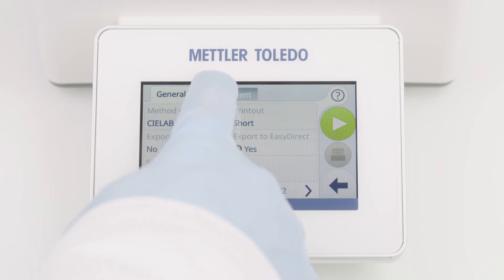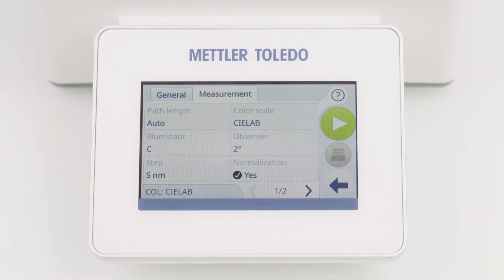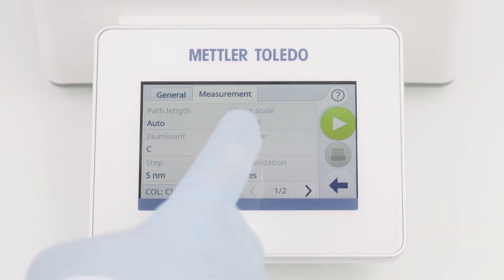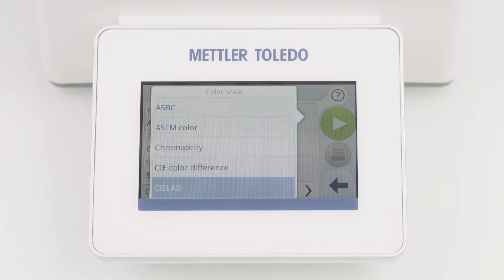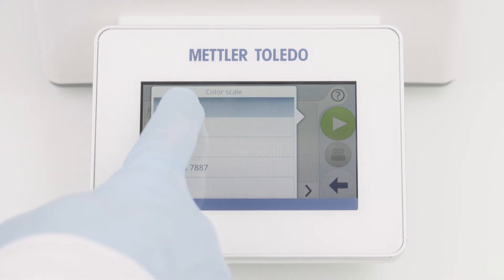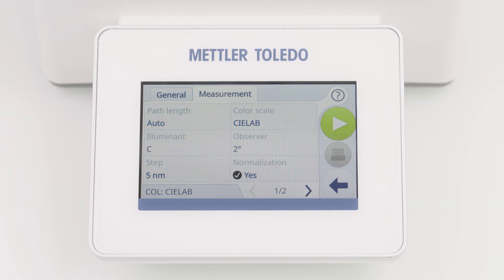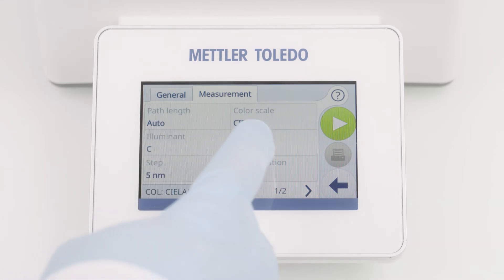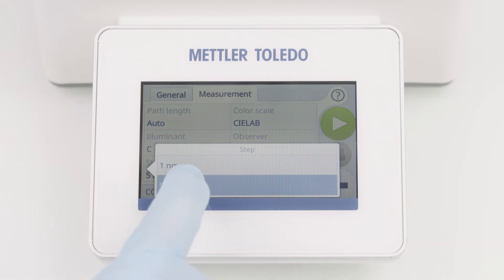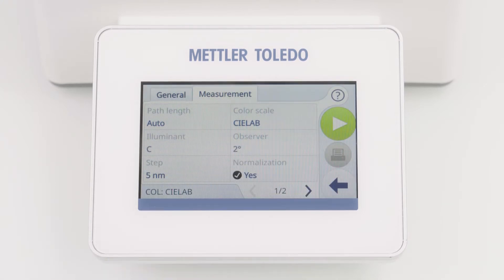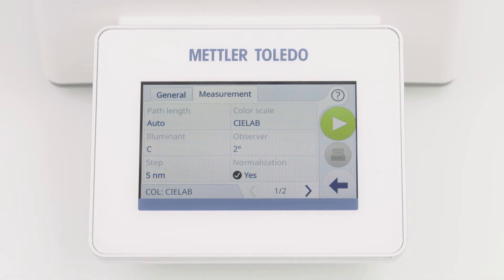The Measurement tab contains all measurement information. You can define the path length and choose a color scale from the list, for example CIELAB color. You can choose between different illuminants and observers, and define the step size: one or five nanometers. To follow the official calculation of the 10 millimeter path length, you can use normalization. With this parameter activated, the measured transmittance values are automatically recalculated to this path length.